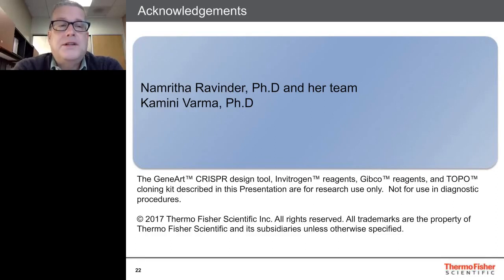So I touched on some of that during the webinar. I think some of the things that are useful would be to choose the method that is most appropriate for the type of edit you want to detect. In other words, the way that you detect a random sloppy deletion would be different from detecting a SNP. And so the types of technologies used for discriminating between those types of changes would be useful for that.